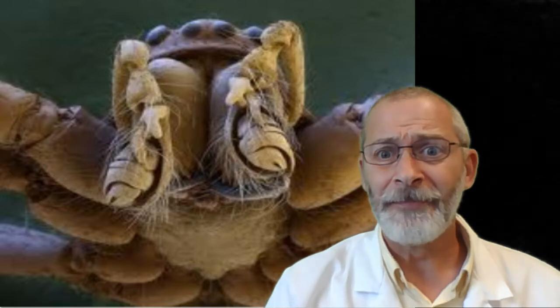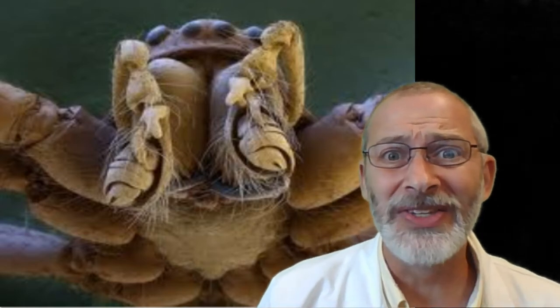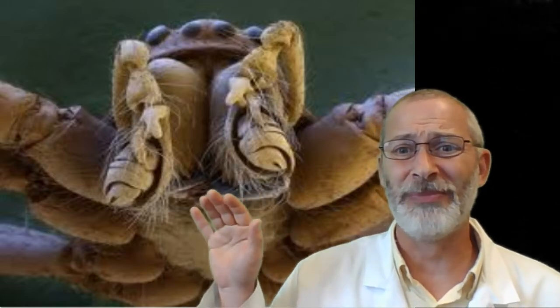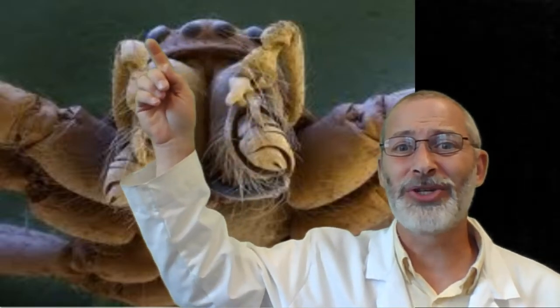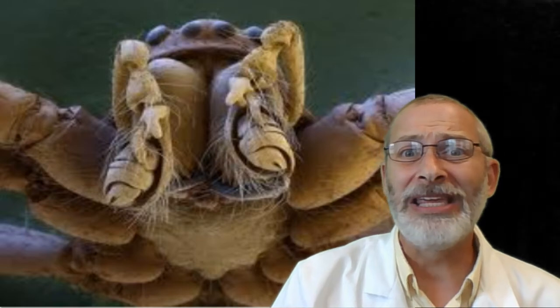I hope none of you have arachnophobia because if you know what arachnophobia is, it's the fear of these things. And I'm just getting the willies getting this close to him. Oh, he's got this furry stuff on him, and look at his eyeballs. Altogether, this creature has 8 eyeballs and 8 legs. This is a spider. Pretty freaky picture of a spider.